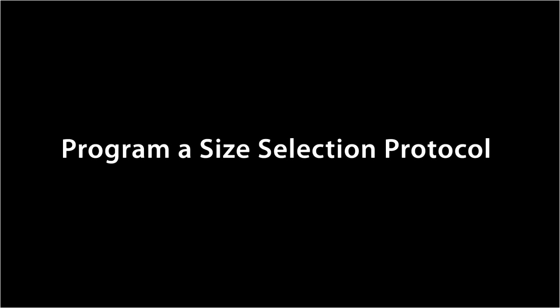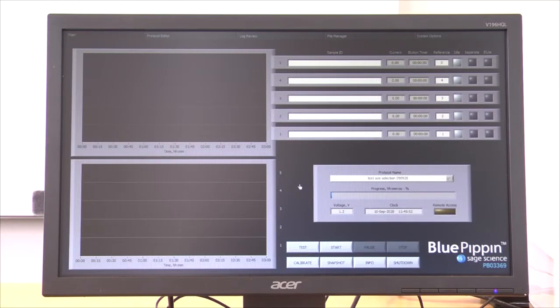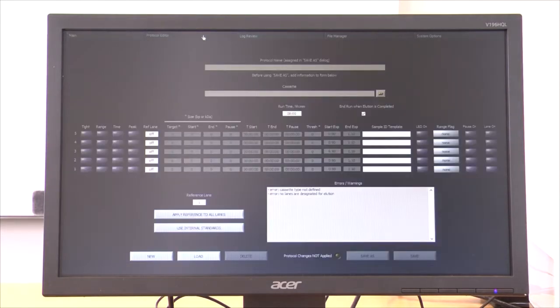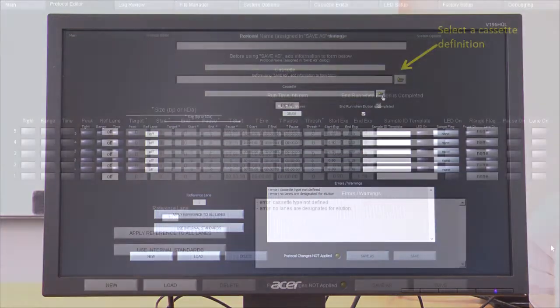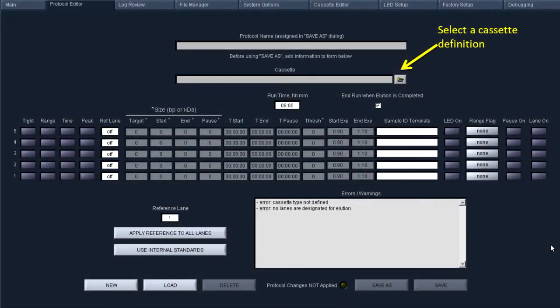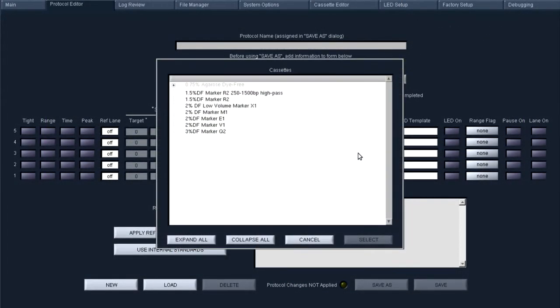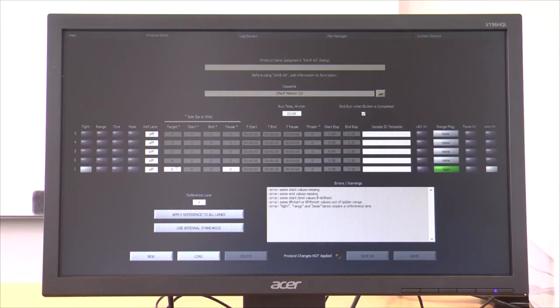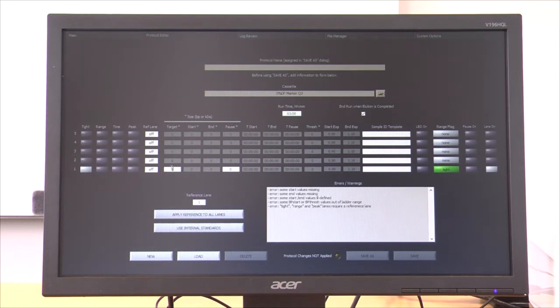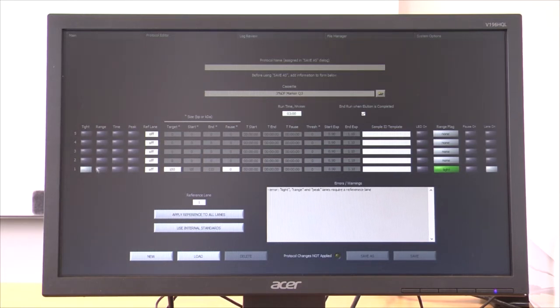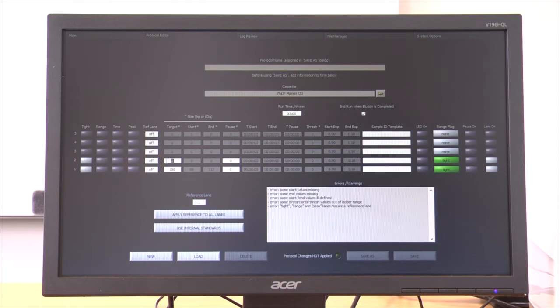The first step is to select a cassette definition in software and to program the size selection for each DNA sample. The cassette definition reflects the agarose percentage and whether an internal or external marker is used in the gel cassette. Size selection parameters are entered as either a target or a range.